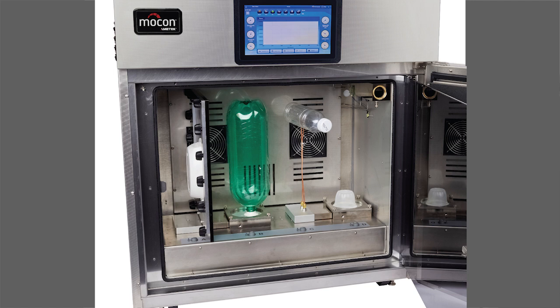And then I've got oxygen on the outside that's permeating through. And these lines will then carry it back into the instrument to the detector, where we will quantify the OTR into the package. So we can do this with oxygen transmission rate and also with water vapor transmission rate, looking at how these gases move through the package walls.